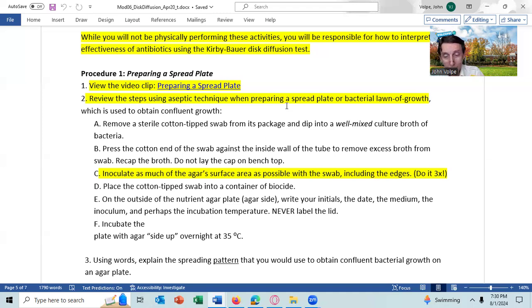And then she showed it to me and said, how can I measure the zone of inhibition? And I said, well, you didn't swab the plate everywhere, so you cannot measure the zone of inhibition. You will either have to repeat the experiment or you can use your lab partner's plate, because on her plate, it was totally impossible. You need to swab everywhere.